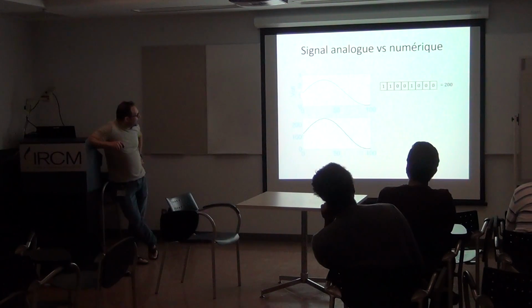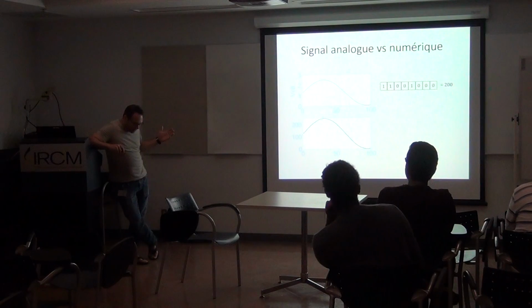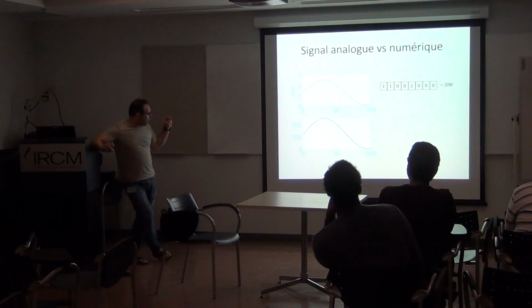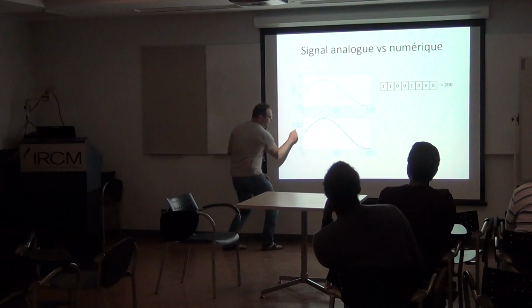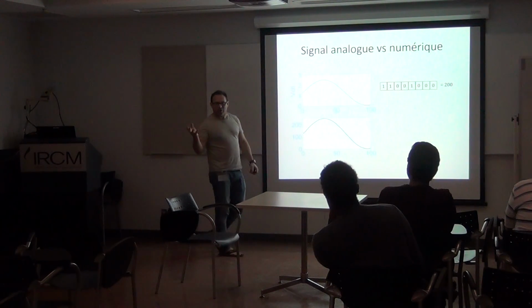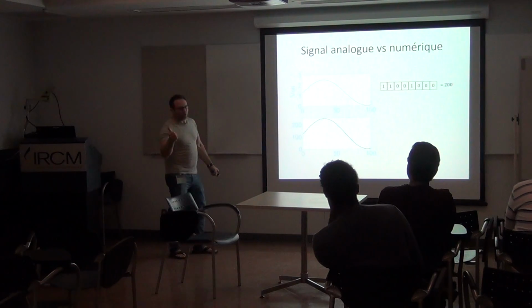An analog signal will always be pure, and then you convert it to something digital. The way you are able to get details into this signal will make your converter a good one, or not really good. Okay?